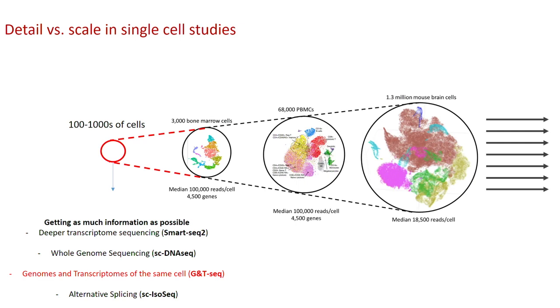And something else that we're working quite a bit on now is because a lot of the droplet-based single cell sequencing methods just look at 3' tag sequencing or incomplete coverage of the transcript, we want to understand more about splicing in single cells and to use long read sequencing to interpret which isoforms of which genes are expressed at the single cell level. And this is something at the moment that is definitely restricted to just looking at hundreds or thousands of cells.